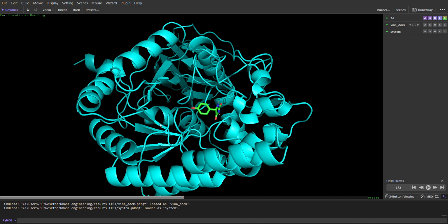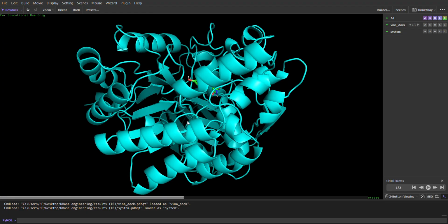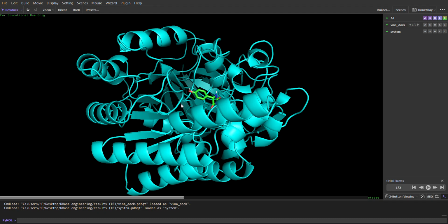These loops should play a role because we see a repeated pattern, and one of the functions of these loops is that they vibrate a lot on small kinetic energy. When we put in heat energy, maybe at a 30-degree temperature, these loops can vibrate a lot, and the pattern of vibration determines specificity.